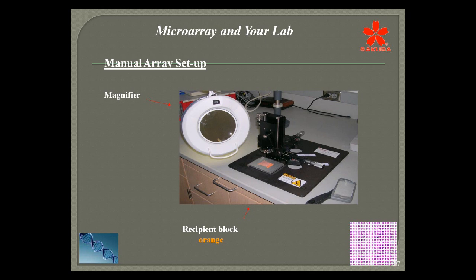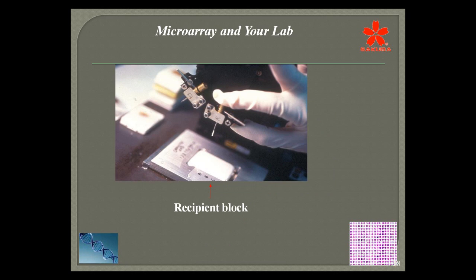And it's like anything else that we're doing in histology, as far as orientation is concerned, you'll need to make these where you put the block in the same way every time so that your block is constructed the same way every time. It's a little more precise, and we just need to become used to that as we're making our array blocks. Now, this is the recipient block here, which is a block of just paraffin. You're seeing the block as it's well seated into the arrayer, and that's if you use an arrayer system.